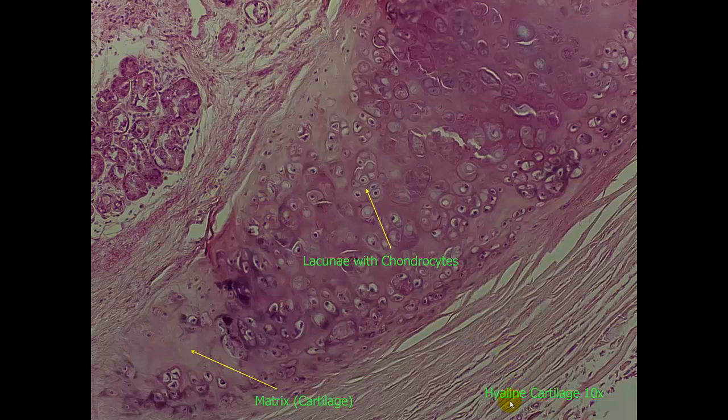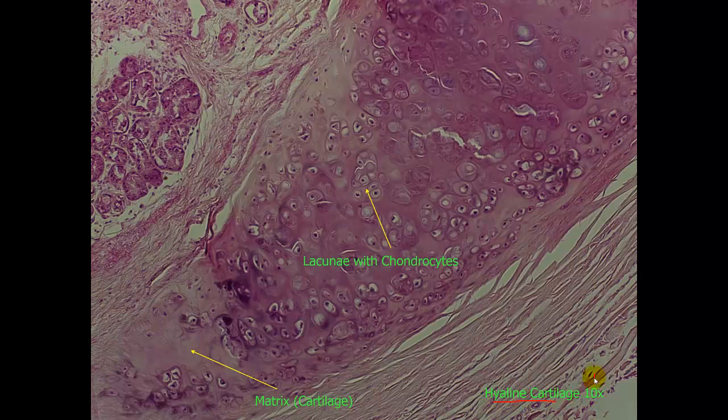Here is cartilage. This is called hyaline cartilage. This is a 10x objective. In hyaline cartilage, we have these clear spaces that we can see. These are the lacunae, or little lakes as they are termed. And if they are grouped together, they are called cell nests. Each of these lacunae hold one chondrocyte, which is the cartilage cell. The matrix is relatively dense cartilage, and can be used for things such as on the ends of bones to help with friction. That is called articular cartilage.